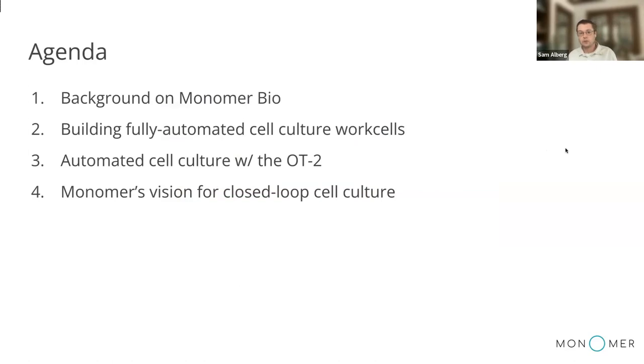In terms of an agenda for today, we're going to start today's webinar with some background on Monomer Bio, the company that Carter and I work for. We're then going to talk specifically about building fully automated cell culture work cells. And so we'll get into the details on how we leverage the Opentrons OT-2 as part of a work cell that we power with our software. Then I'm going to hand it to Carter, who's going to talk through automating cell culture with the OT-2, both from a liquid handling perspective and from a perspective of making it compatible with robotic arms, which are going to be loading plates on and off deck on the Opentrons. And then we'll finish today with a quick view into Monomer's vision for closed loop cell culture.